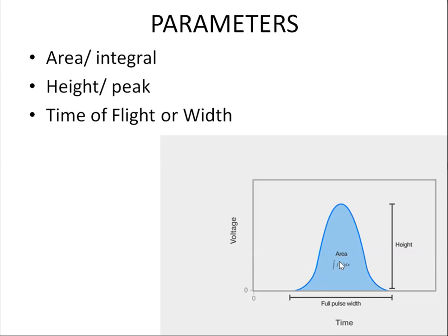HLA-B27? Why HLA-B27? HLA-B27 is again a parameter which is stained for a fluorescent marker, so you can see it in area. Height is specifically seen, I discussed this during our lectures, in one of the universal plots to discriminate a population, forward scatter height versus forward scatter area. So singlet. Only for singlets we mostly use height. Beyond that, during our routine clinical flow cytometry, we'll be using only area. We'll be only interested in the area of the signal.